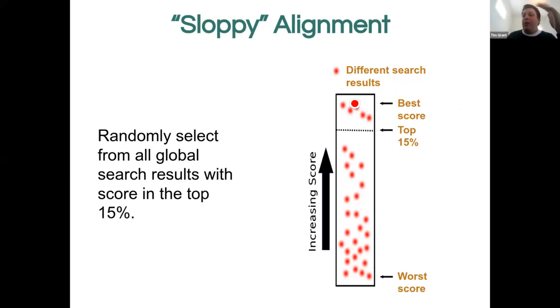But when your model starts to converge and get more and more correct, this spreads out. Your worst score is much worse than your best score. So now you only have maybe one, or in this case, because we have 5 views that are very similar, 5 views above this threshold that you end up picking.